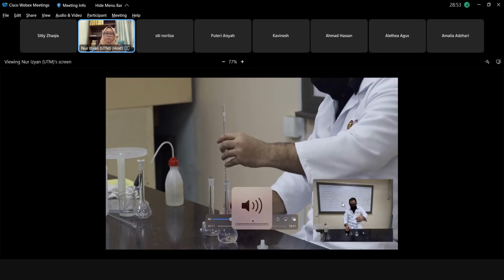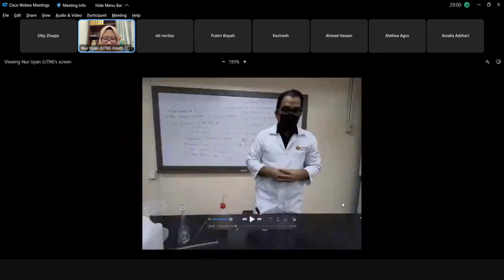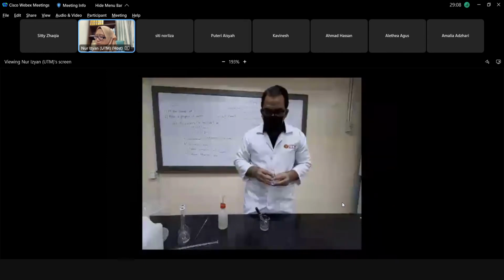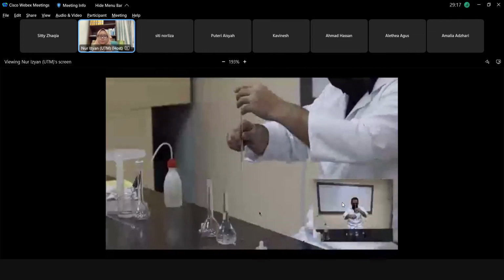Of 1000 ppm zinc, the next step is to prepare the working solution. We need to prepare 10 ppm of working solution from the stock solution that we have prepared earlier. Now I'm going to show you how that can be done.